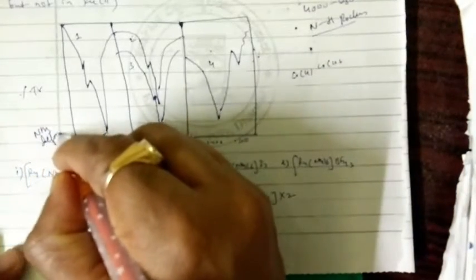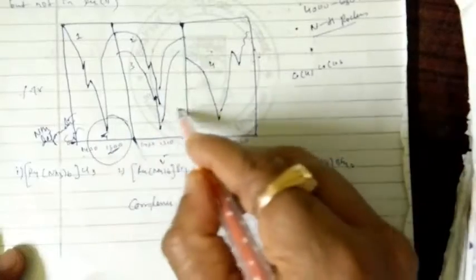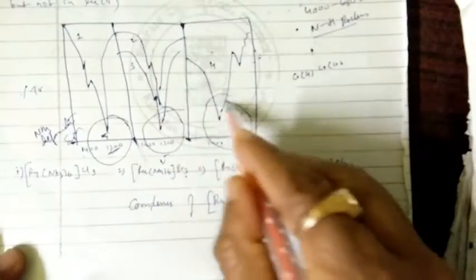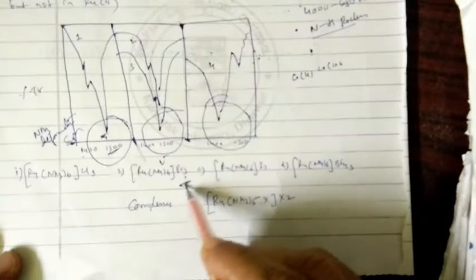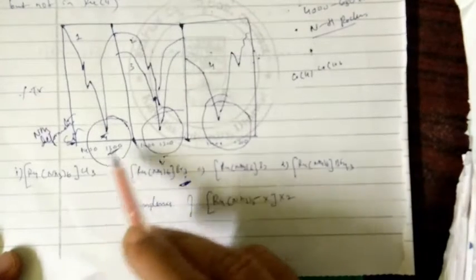NH3 deformation symmetric is observed at 1313 for these four complexes of the halides, Br2, I2, BF4 twice, and Cl twice.